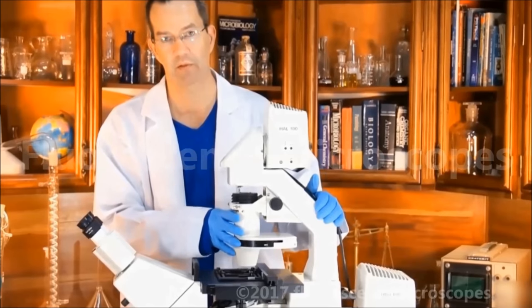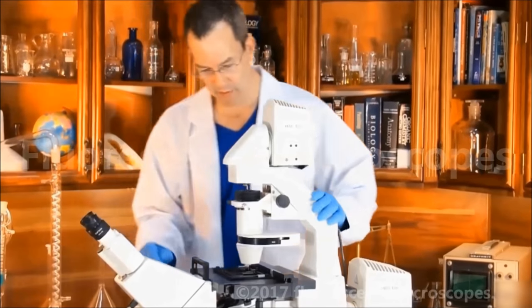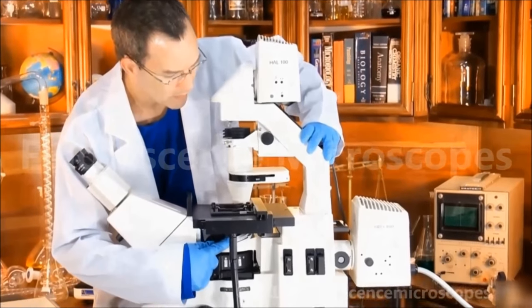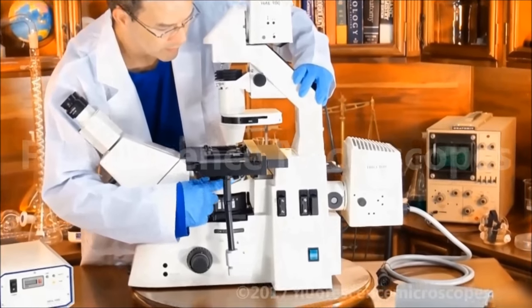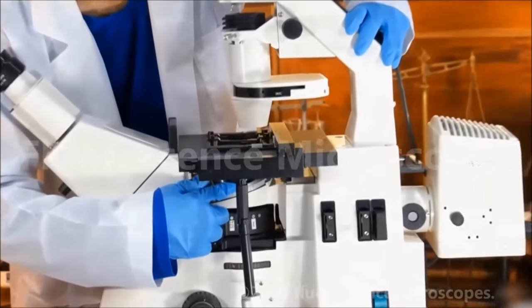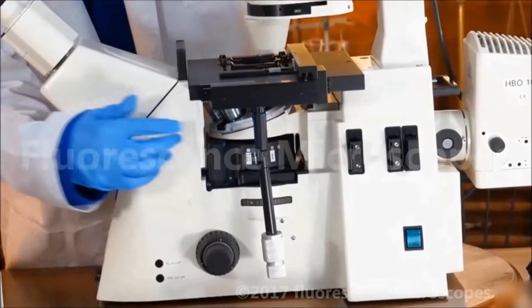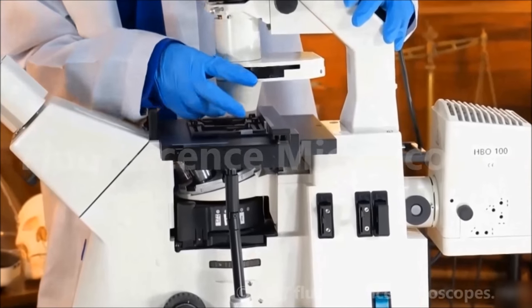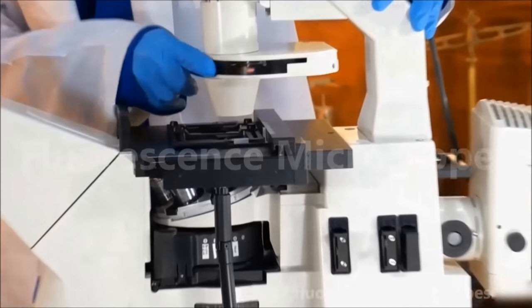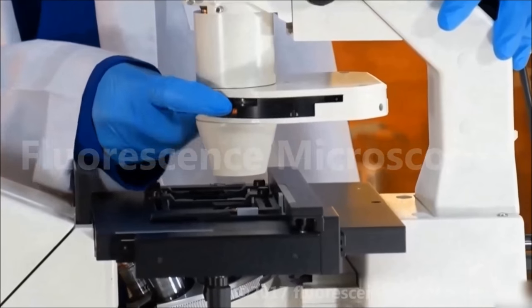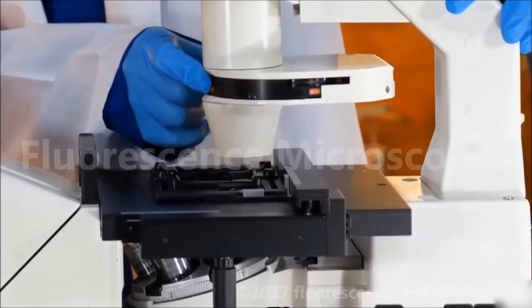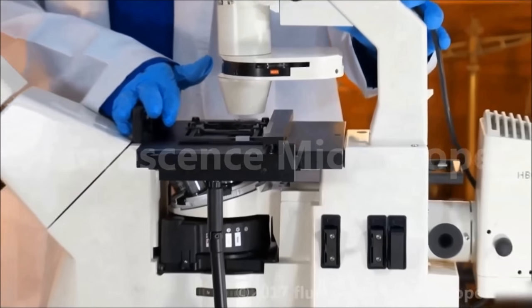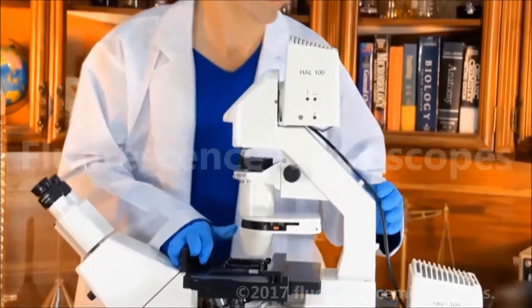This system is completely capable of doing DIC, and I know that because of my DIC slots underneath my objectives as well as my DIC spaces. You can see that in the red, my two DIC spaces for prisms in my condenser. So if you need DIC, if you need that configuration, let us know. We can configure that.